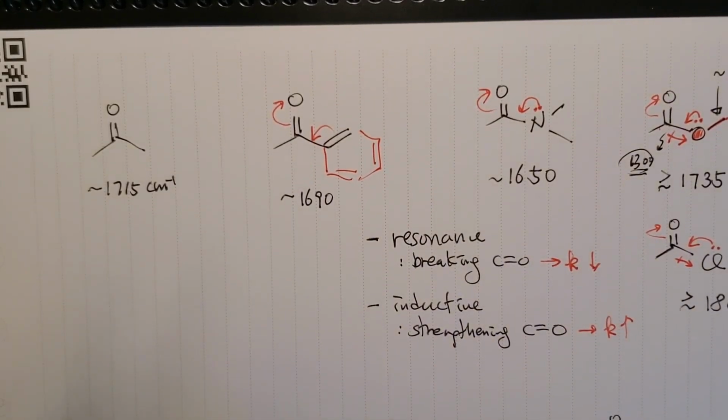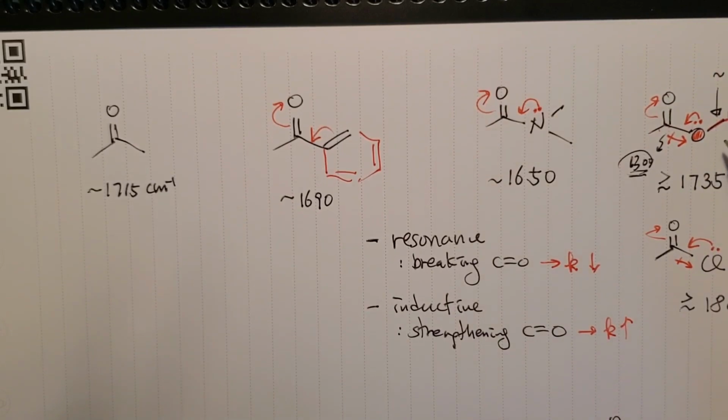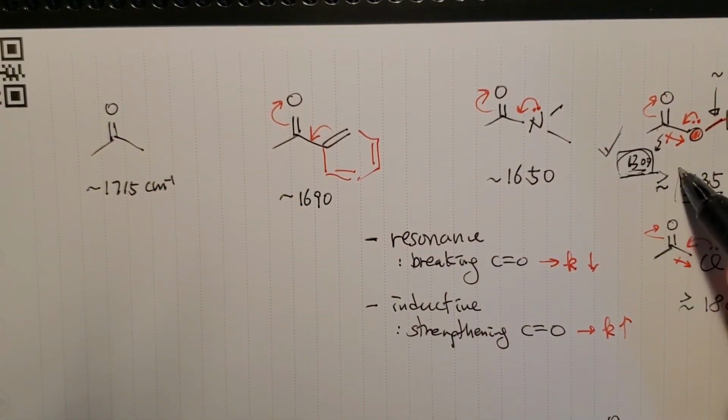See, ether can have 1000 to 1100, again the other 1000 to 1100, two peaks, and you have 17 something, right? So you know this could be the case, not this sometimes. So the only key to differentiate those two kinds of isomers would be finding this intense CO single bond, or you pay attention to the number more carefully. But I would bet on this more than this number, and here is the why.